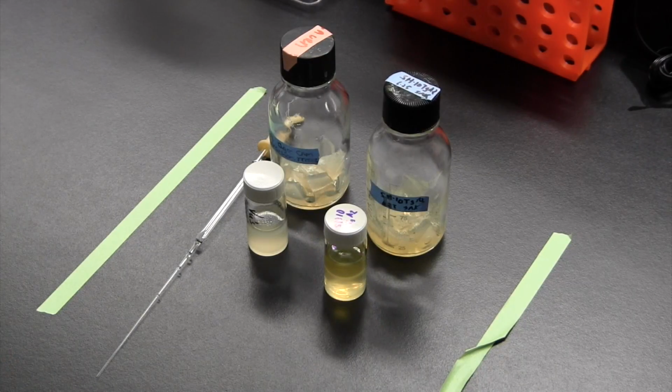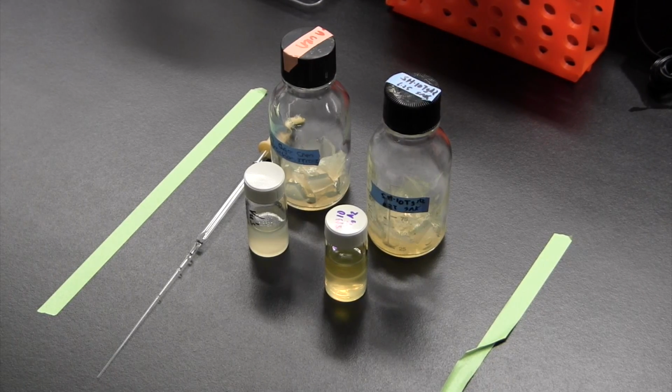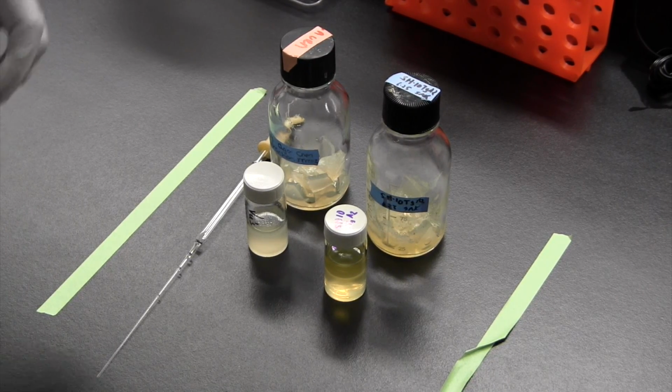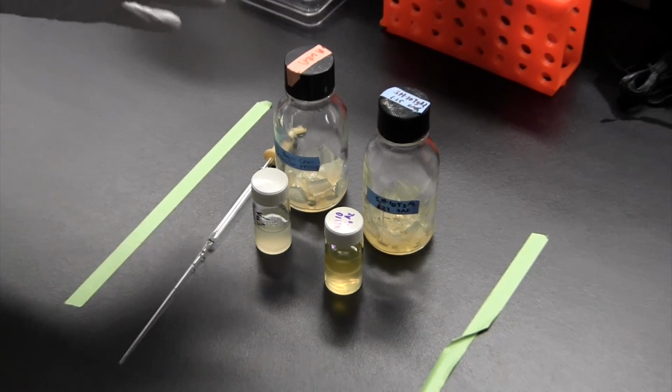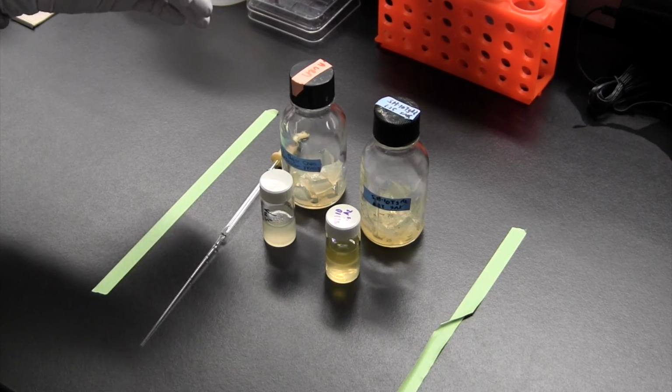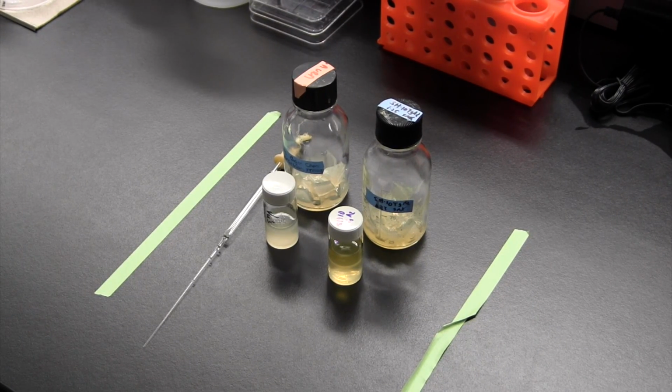Okay, so we're now entering part 3 of our chemical extraction, which could have taken you different periods of time depending upon how you structured your class. And we're just going to show you a couple of examples of things that you might encounter as a result of both the different types of media that you're going to use, as well as the different bacteria that might be growing on that media when you do the chemical extraction.